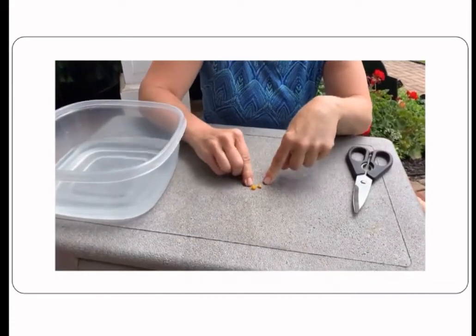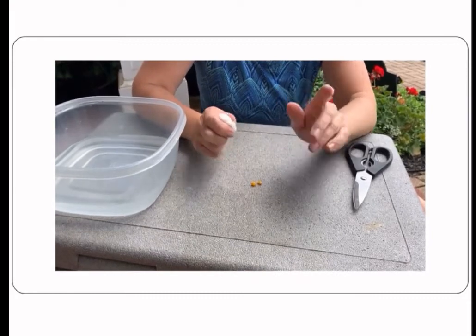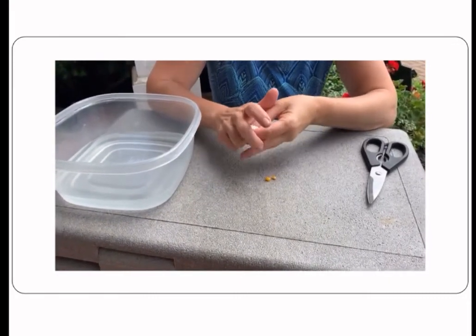So we're going to be planting some fast plant seeds in peat, which is kind of like soil, and we won't be able to see what the seeds are doing at the very beginning of their life cycle. So what we're going to do is set up a germination necklace. In your kit, you should have gotten 2 corn seeds and some cotton balls, and we're going to give the corn seeds the conditions they need to grow so that we can watch them.